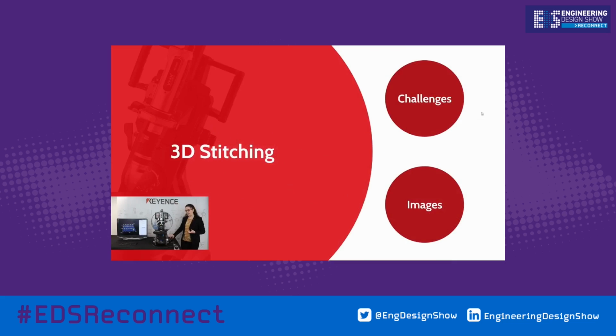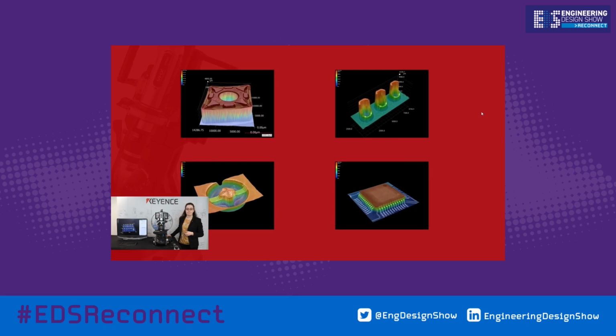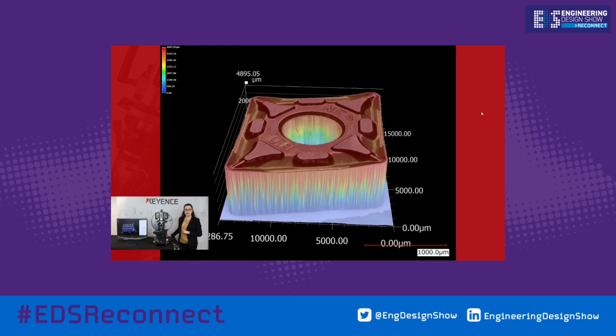Some more examples of where this 3D stitching can be used. I've got some images here. First of all, we've got our cutting tool that I showed you a second ago. Here we've done a full 3D composition of the whole thing. So we can see both all the surface of the part, but also the height of the cutting tool off the surface of the stage as well.